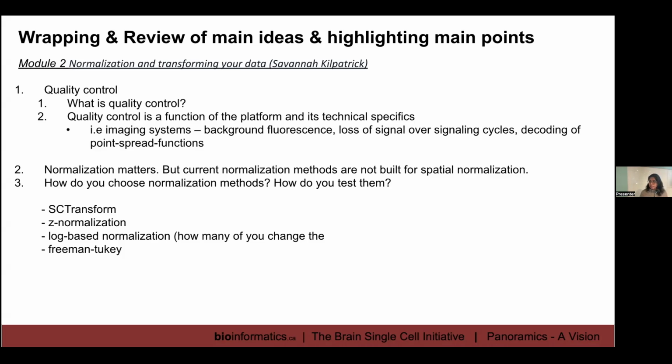So sometimes it is just the nature of your tissue, and you cannot push the system any further than that. And there's another example where the tissue was just too overinflated because of improper fixation. So this is a technical issue on the tissue fixation side, but the run was successful. It's just that the counts per bin were too poor for me to extract anything viable. So quality control can be attributed to different causes.